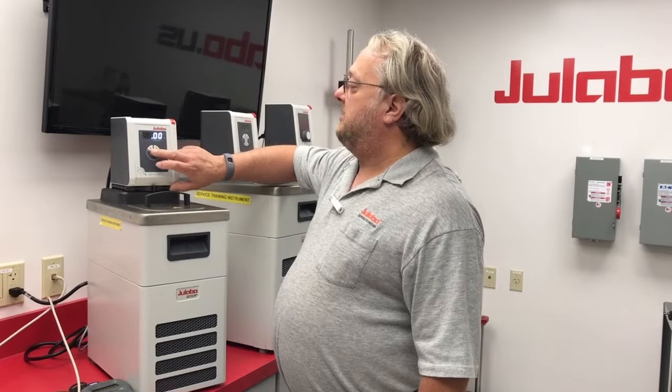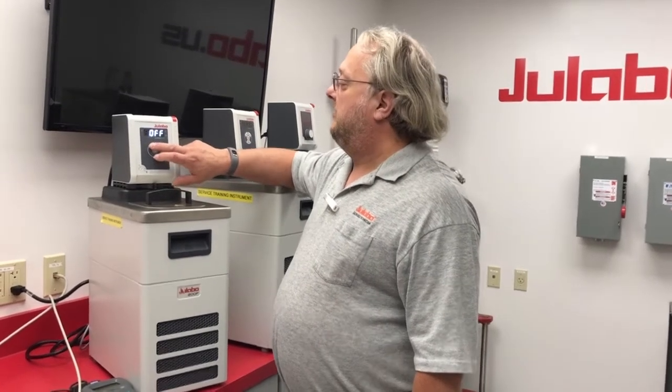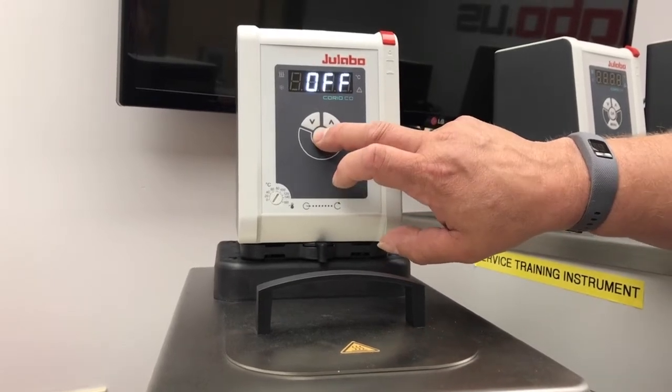First you want to set the temperature to whatever your desired calibration point is, then start the unit.